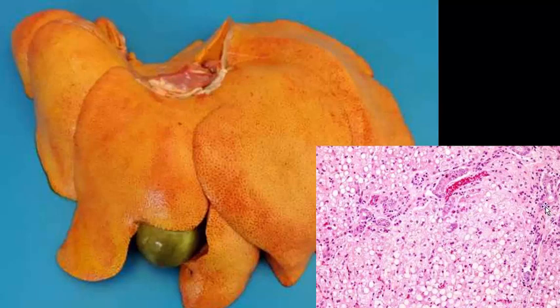A little bit of fibrosis here, which gives a little nodularity. Look at all these bile ducts. So this means that this animal has been injured for a while. There is stimulation of biliary hyperplasia. It's not something that happened overnight. So more of a chronic toxicity. The yellow is fat. The other thing I want you to see, very important: a big fatty liver is going to be bigger. You're going to have rounded edges. Look at how this sort of flops on the table. Looks like it's limp, like a dish rag.